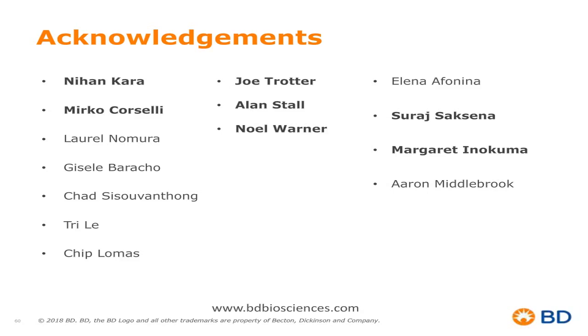A viability stain is an excellent question, and of course that relates to your specific sample that you're working with. Here in this particular panel, in the data that was shown today, I was working with fresh whole blood that had been drawn and then analyzed within a few hours. And in that situation, whole blood has an extremely high viability, where I'm confident in the staining of my samples, where I'm probably working with 98, 99% viable cells.